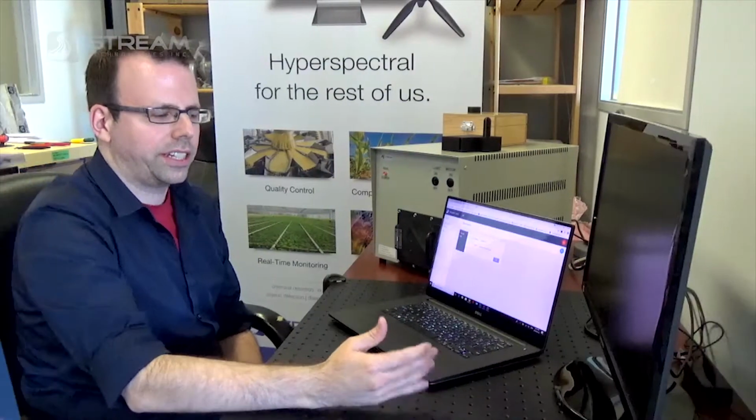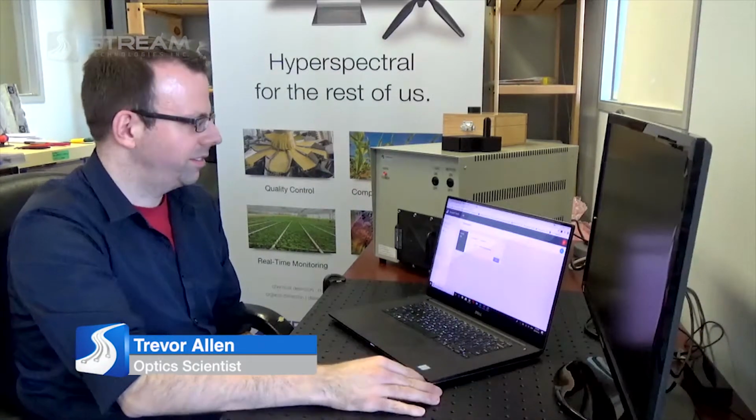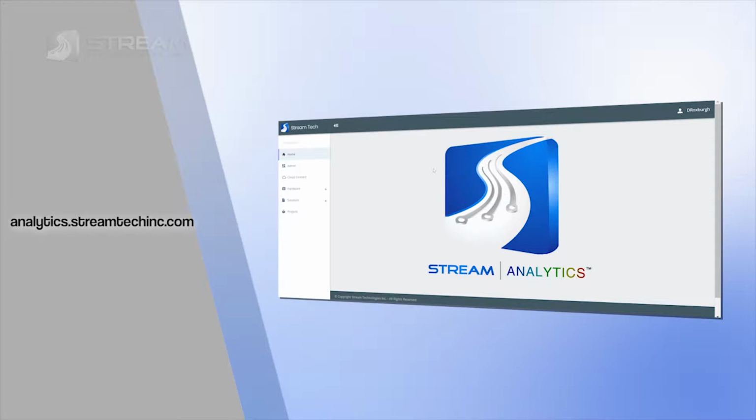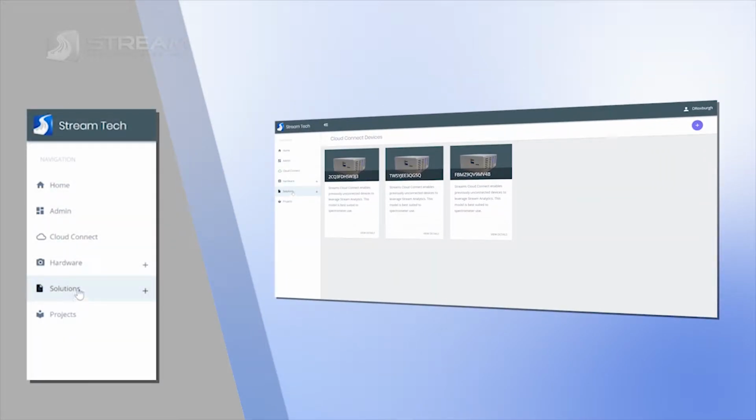So at this point now we need to set up a solution so that we can actually go ahead and start taking data with the LabFlow and begin training on that solution. So when you want to make a solution, you need to go to the main Stream Analytics website. Go back here, and once you're logged in again there, you want to go to the solutions in the sidebar here. When you click that, you get three different options. There's public and private. These are already published, finished solutions that you can choose from. But we want to make a new one, so we go to the draft solutions.